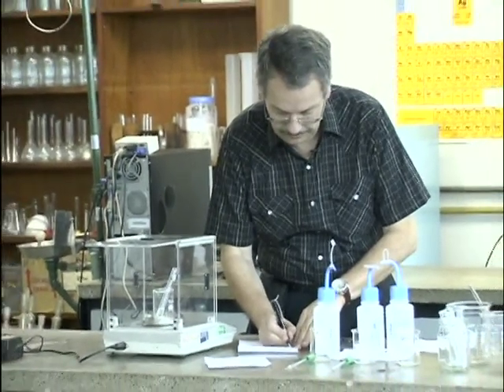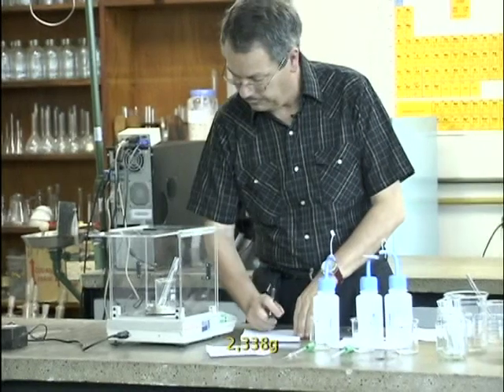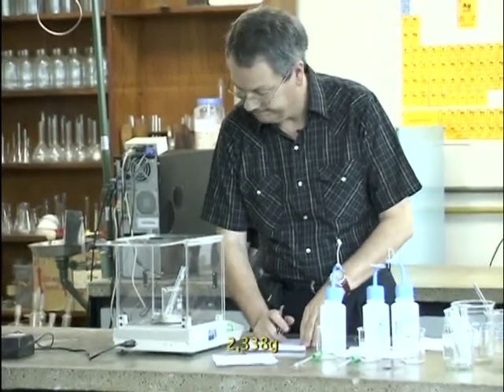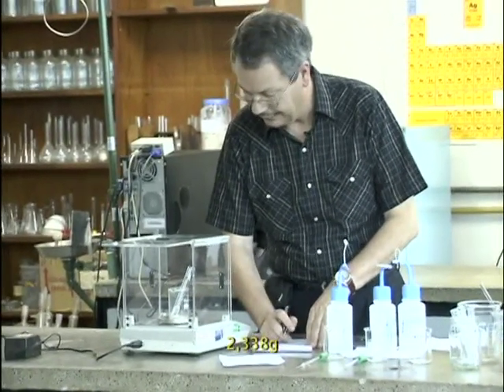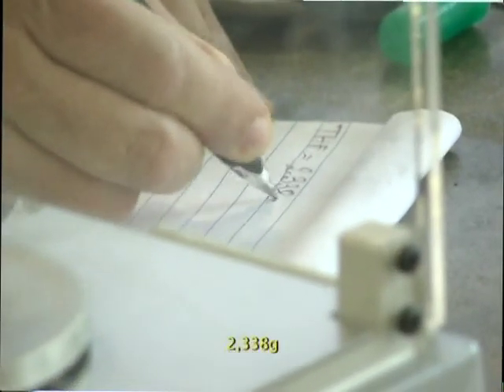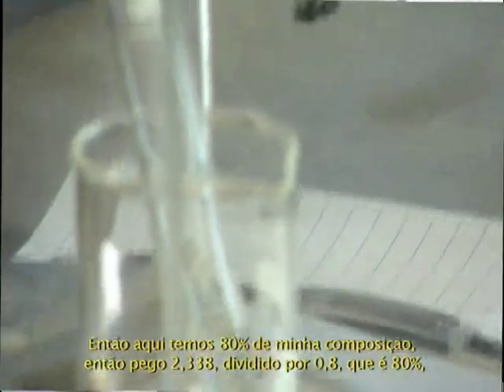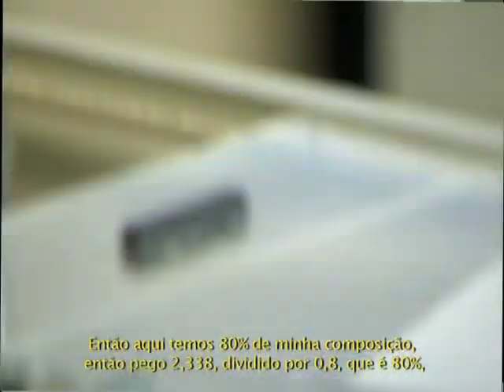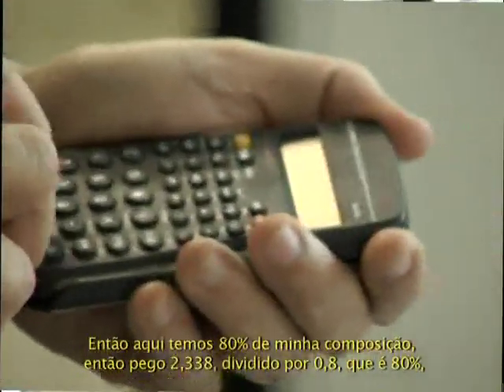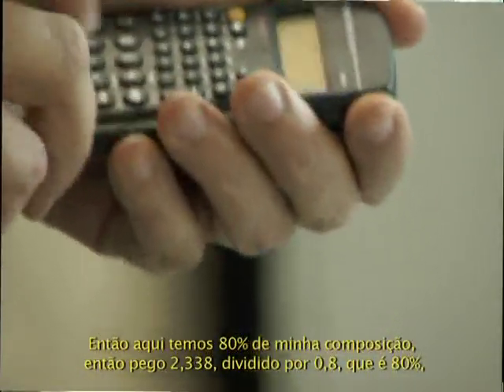This much is exactly, I'll start another page. THF, 2.338 gram. So this is 80% of my composition. I want this, so I take 2.338, divide it by 0.8, which is 80%.